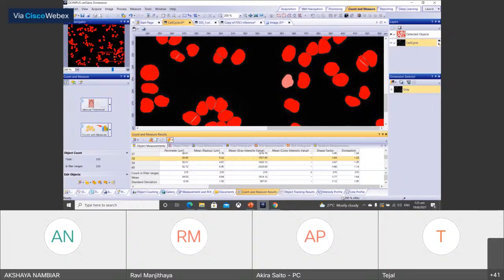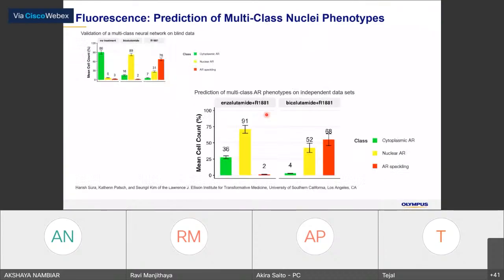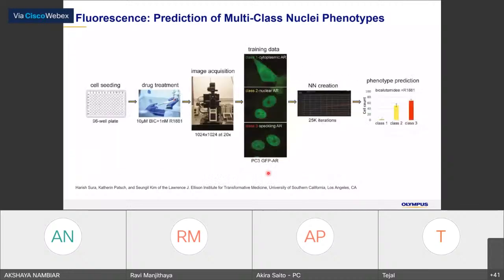Okay, so if that is the question, then as an example I showed in my presentation, this one is not a co-culture, it is one cell line, but they have different kinds of structure.